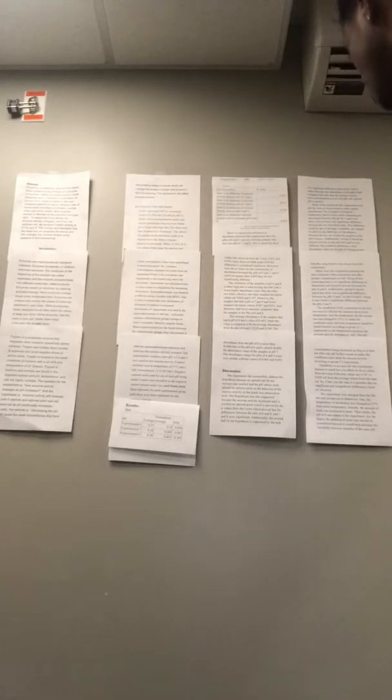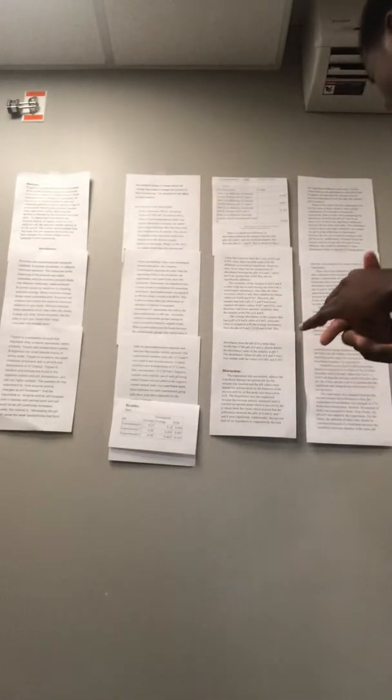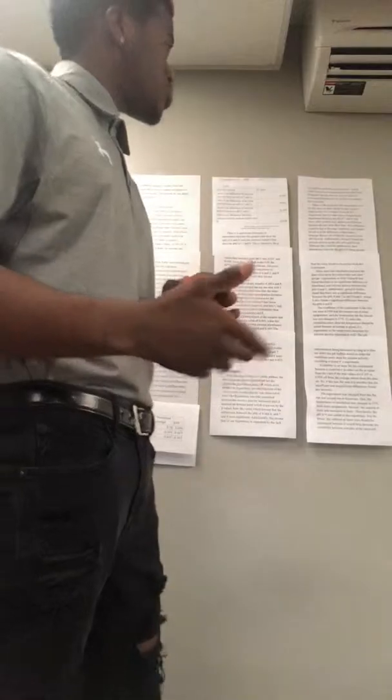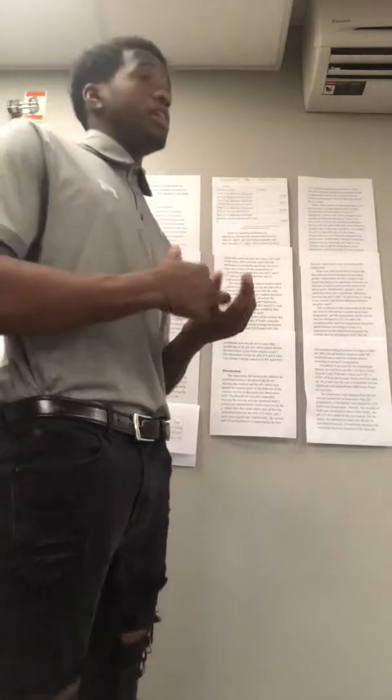Lastly, many groups' results weren't the same. For example, Group B, in their experiment, their p-values when comparing absorbance at 7 and 8 were significant, while ours were not significant, because our p-value at 7 and 8 was above 0.05.